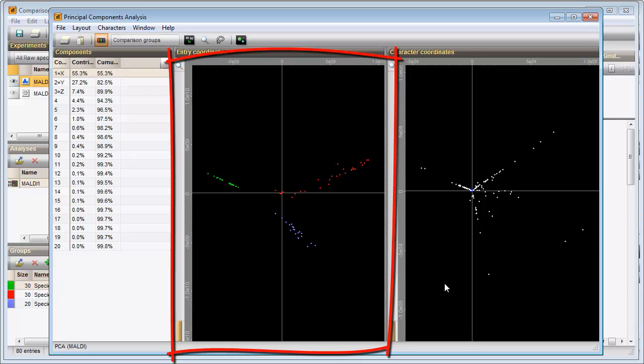The Entry coordinates panel shows the entries plotted to the first two components. By looking at the colors in the Entry coordinates panel we can see that the spectra from the different species are clearly separated.